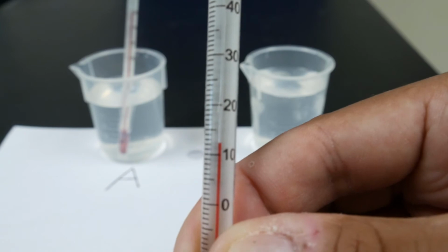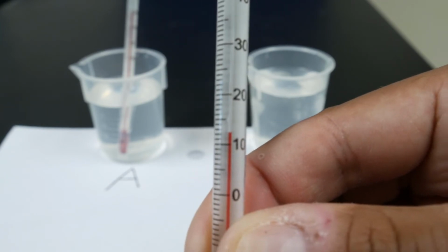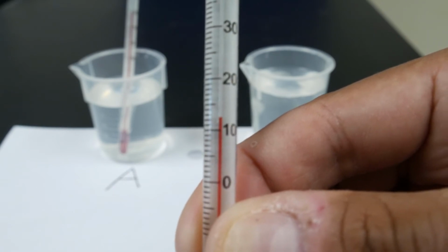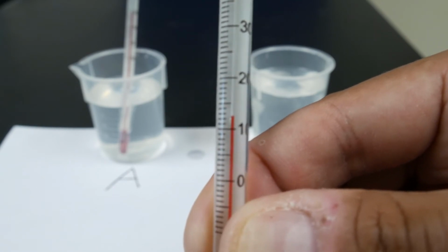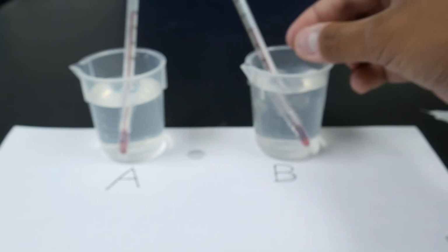All right, so it's been about 1 minute, and we can see that the temperature for beaker B is maybe at about 13 degrees Celsius. So you're going to record about 13 degrees Celsius after 1 minute of ice. So let's put it back in, and we're going to wait for 5 minutes to pass.